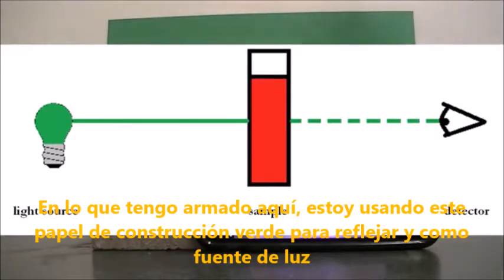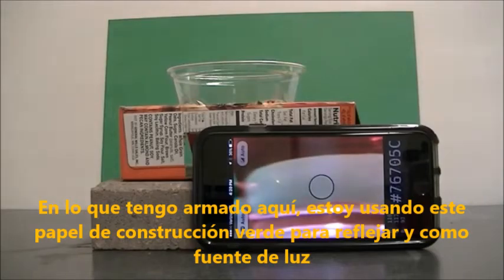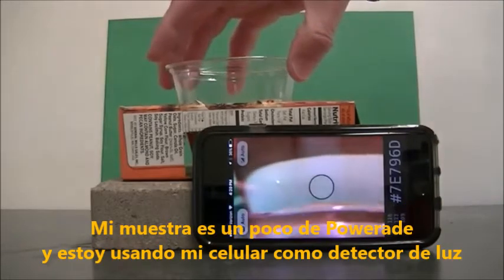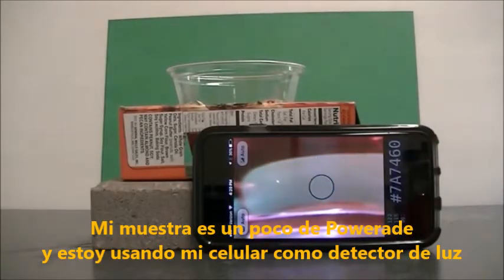In the setup I have here, I'm using light reflected off of this green construction paper as my light source. My sample is just some Powerade and my cell phone is being used as a light detector.